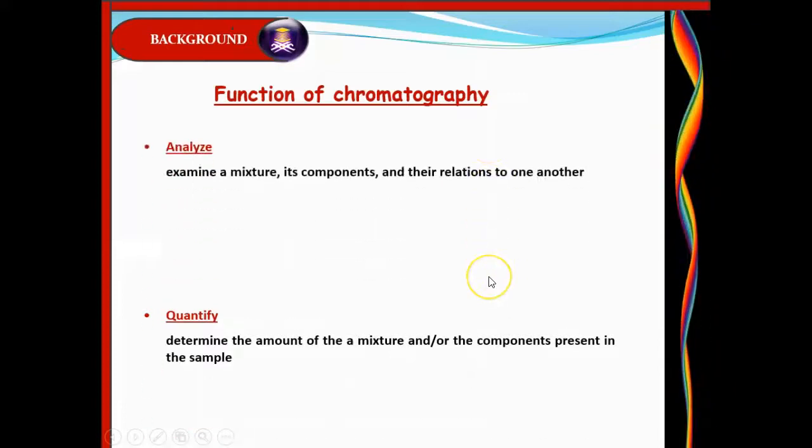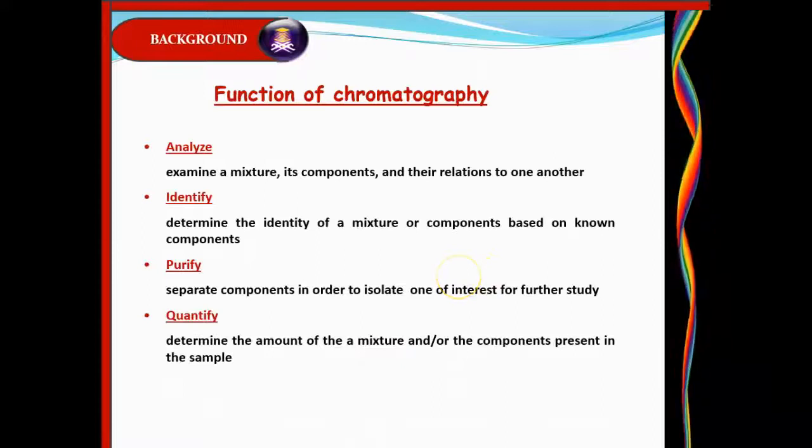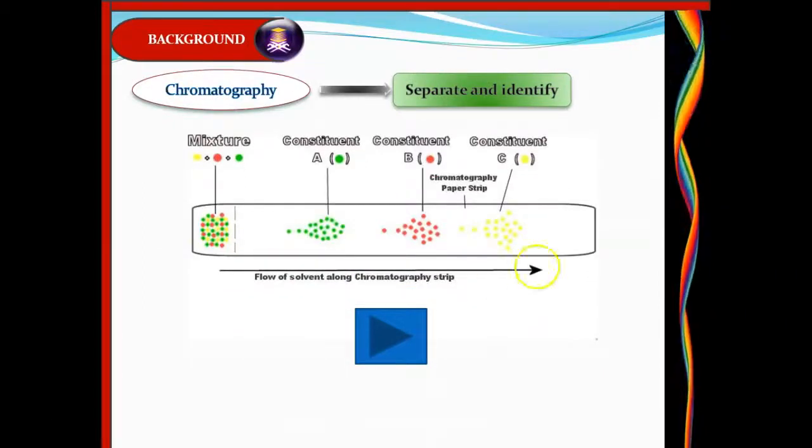Now we look at the function of chromatography. It is the same slide as in the previous slide. This is the result from the paper chromatography.